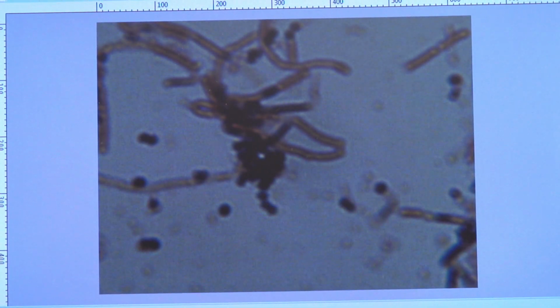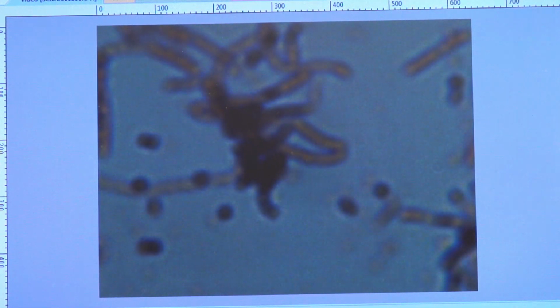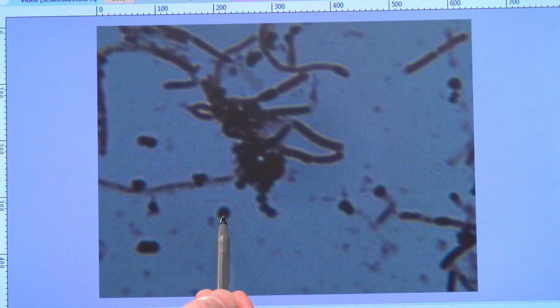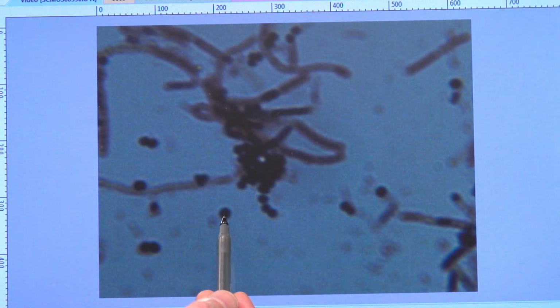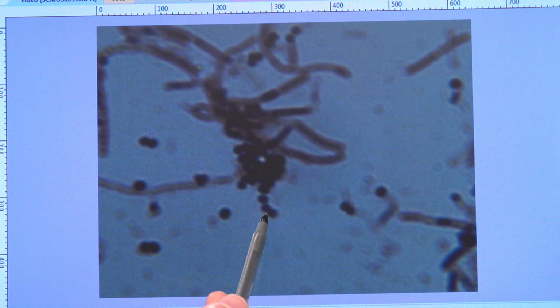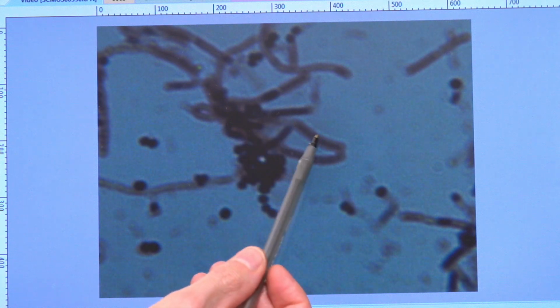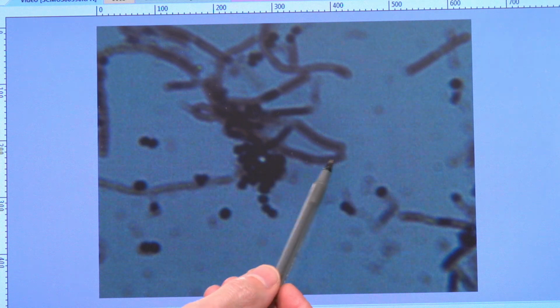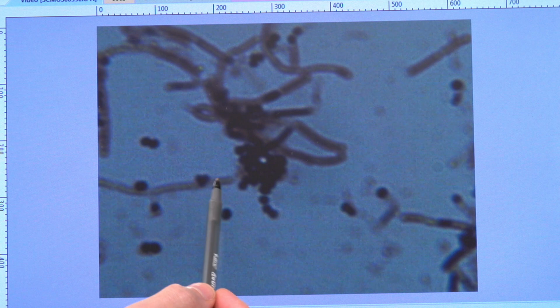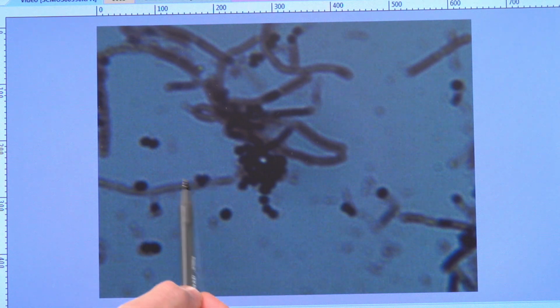Okay, so for example, what is this particular shape called? Right, so let's not call it a circle, and let's not call it a sphere. That is called, that's right, coccus. So that's a coccus, that's a coccus, that's a coccus. Wouldn't you like to be a coccus too? Well, not if you're this bacterium. Right? This bacterium does not want to be a coccus. What type of bacterium is this? That is a bacillus, a very long, stringy bacillus. Okay, so that is what we're looking at there.